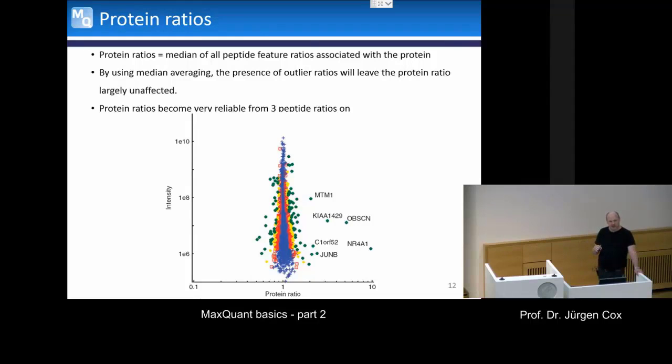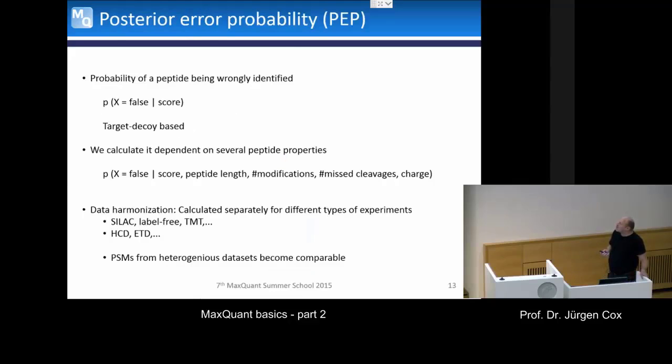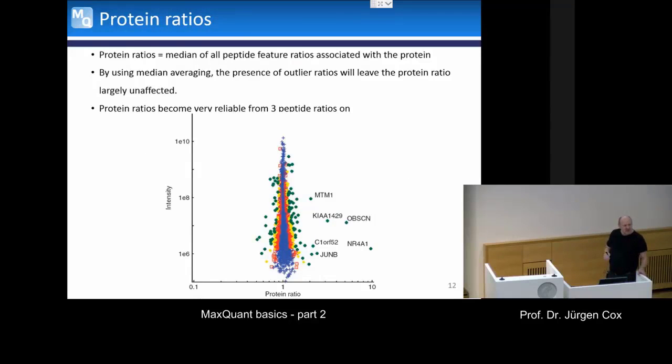So that's why one doesn't want to put them all onto the same level in the summarization. The way it comes already as an intensity is already the perfect way to put this information into this game. Okay, so that was the quantification and how it propagates to the protein level.